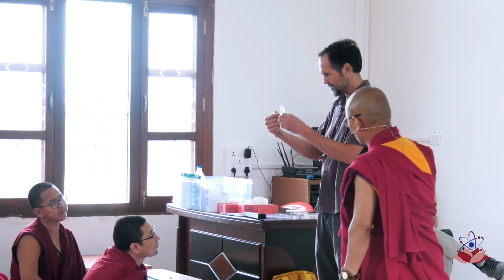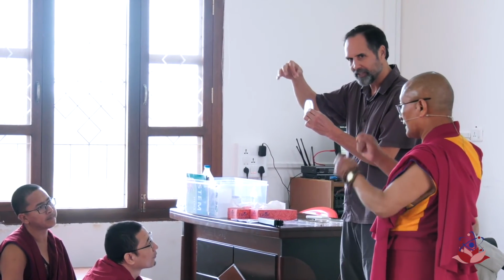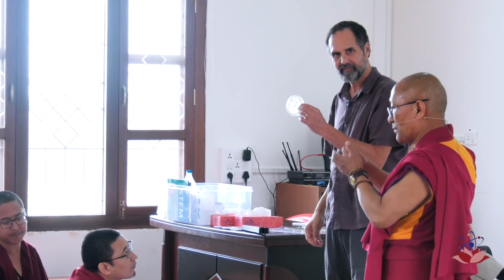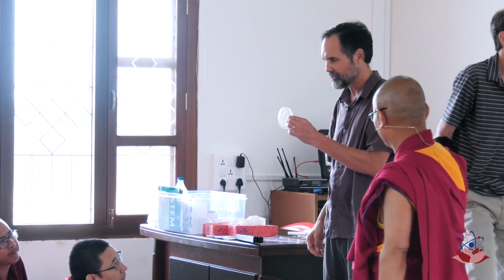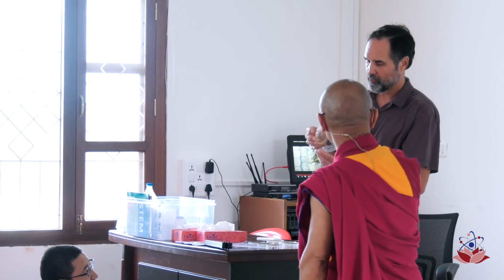We see, remember we picked at that dot with our toothpicks. Okay, now what you can't see today, there's no water on the plate today. Where was the water? Yesterday, there was water.